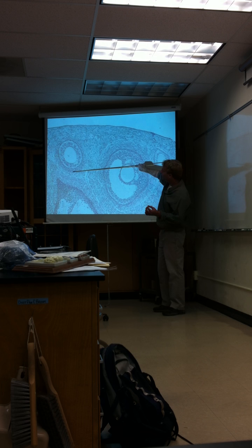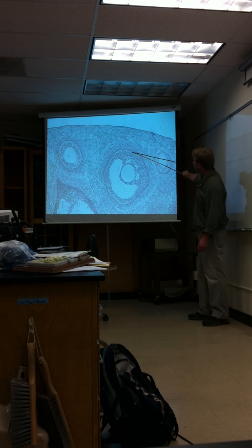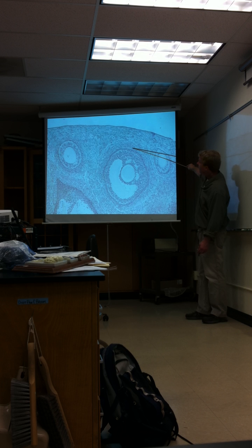And again, you don't need to worry about theca interna or theca externa. I'm not going to hold you to those two. You just need to know together they make up that theca folliculi. So you have the theca folliculi there. You can also see here are the granulosa cells just outside of them. I'll just point there, theca folliculi. So theca folliculi is the layer outside.